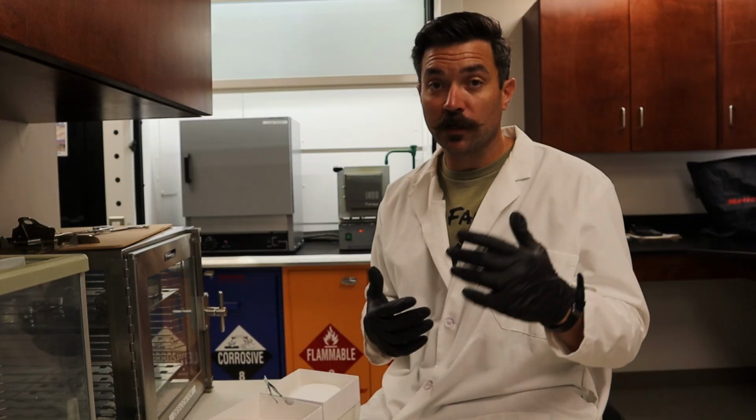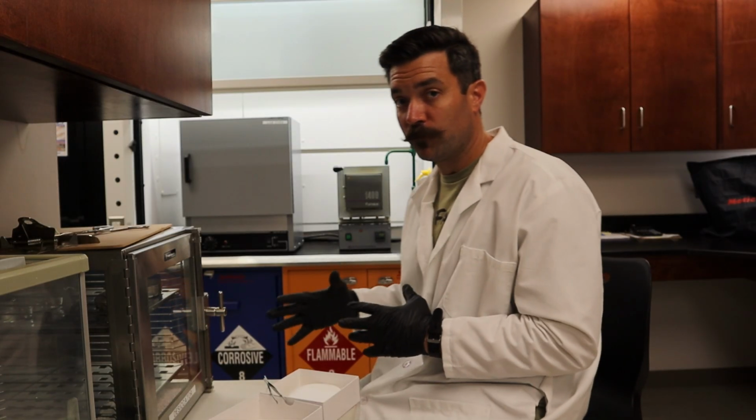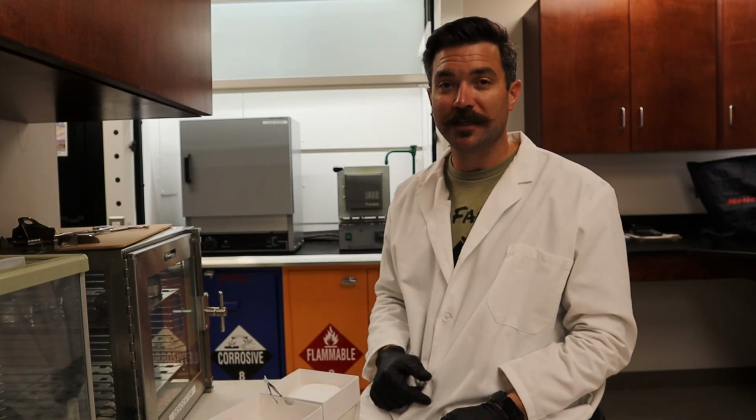All of those steps we're going to show you here real shortly, but just wanted to kind of go over it in general beforehand, and now you'll get to actually watch us do the physical process before we take you over to the whiteboard and solve for both the mixed liquor and the mixed liquor volatiles. So let's get into it.